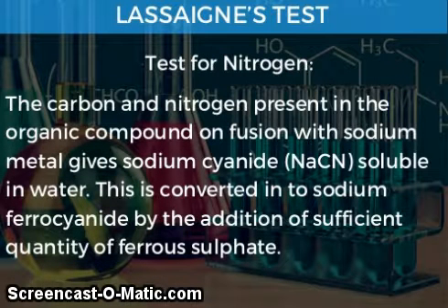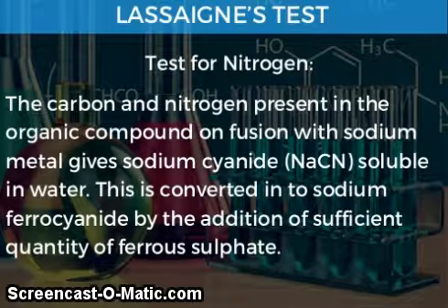Now friends, test for nitrogen. The carbon and nitrogen present in the organic compound on fusion with sodium metal give sodium cyanide, soluble in water, and this is converted into sodium ferrocyanide by addition of a sufficient quantity of ferrous sulfate.